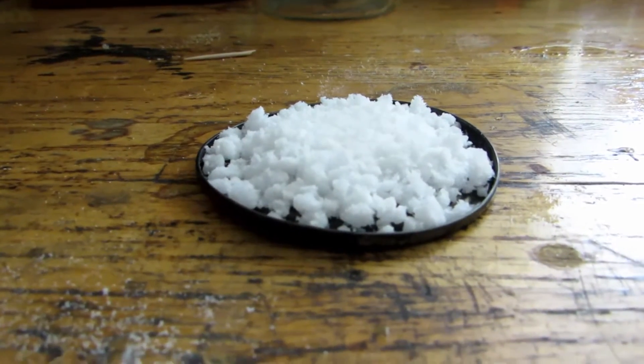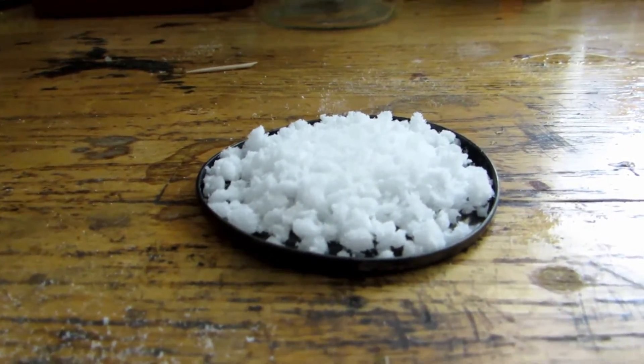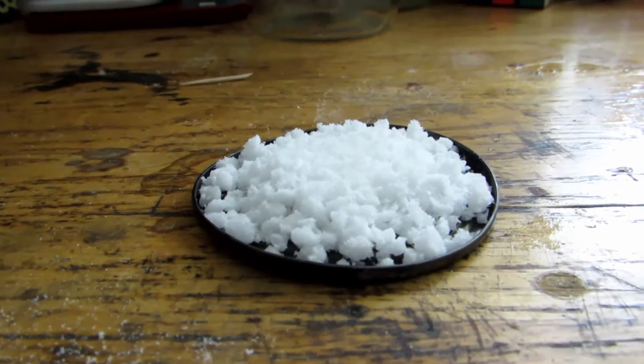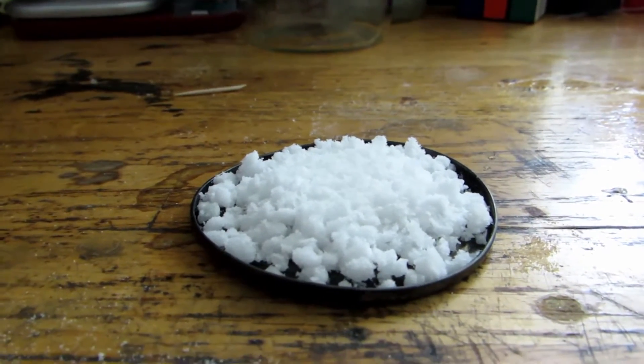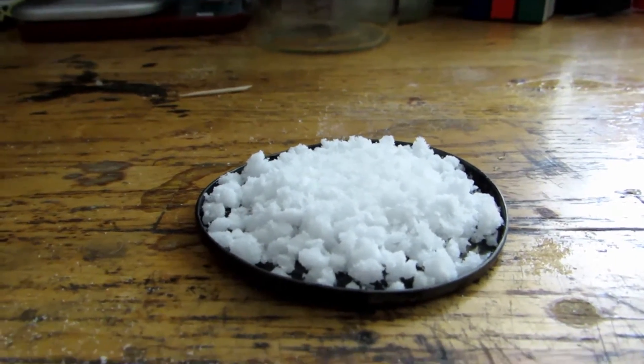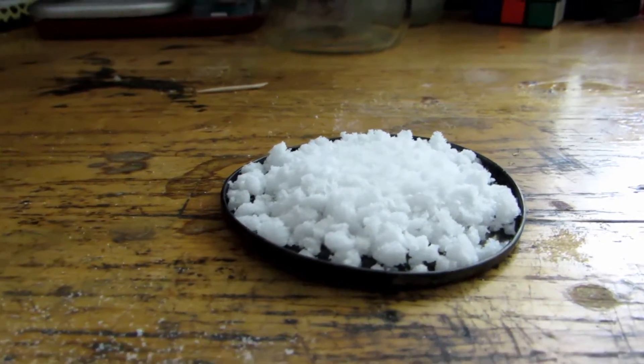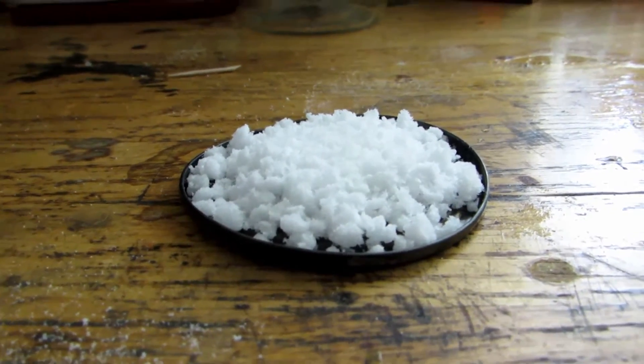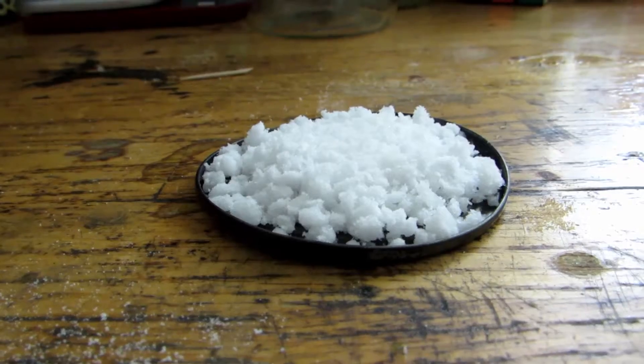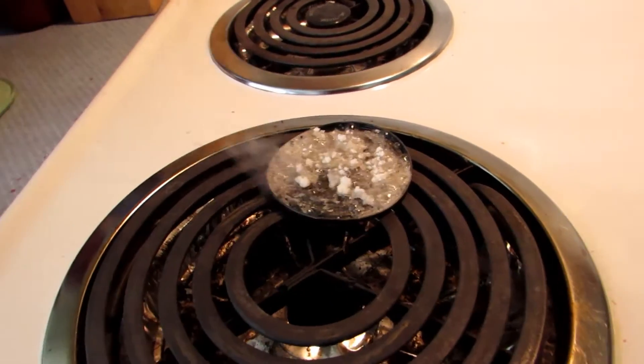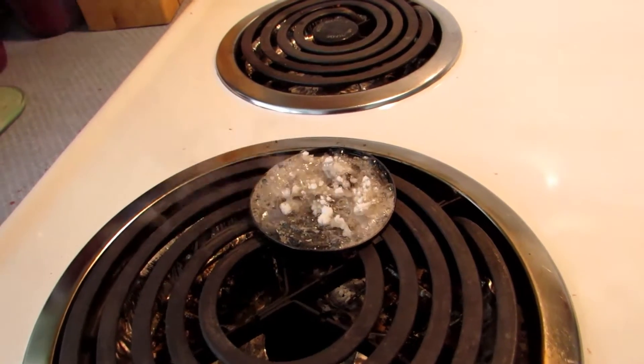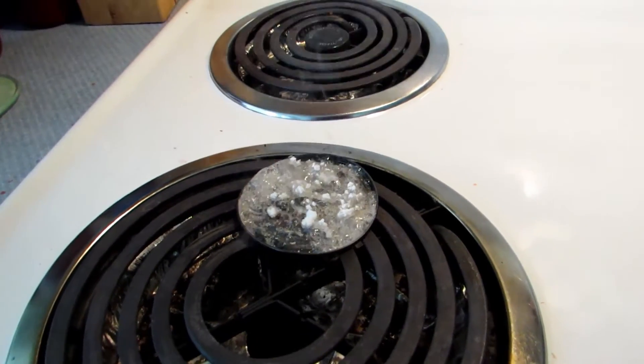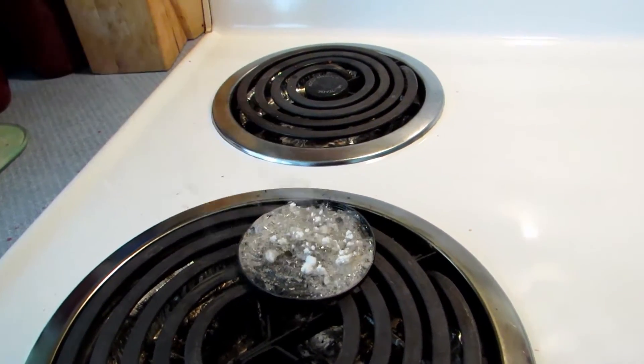Instead of using a blowtorch, I've decided to try putting it on my stove at home and just turn the stove to max temperature. This should get hot enough. We're only releasing water vapor, so nothing toxic should be produced and this should be okay to do inside. After just like five minutes on the heat, it's really bubbling and this is definitely working. We're just going to let this keep running on the stove until there's no more bubbling.